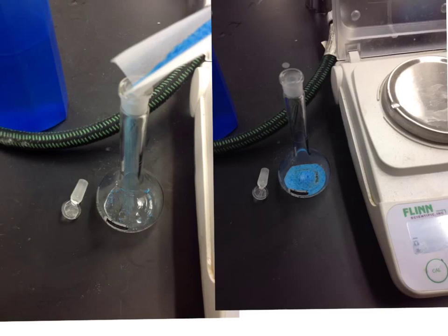So that's what we're going to use to make our solutions today. The volumetric flask is going to be exactly 50 milliliters, and it will have a fill line here, which will give us the exact amount of solution we need. So that's what we'll get to in the next step.